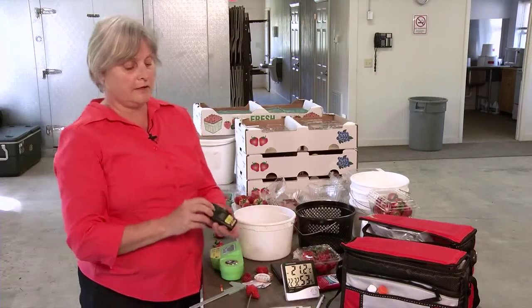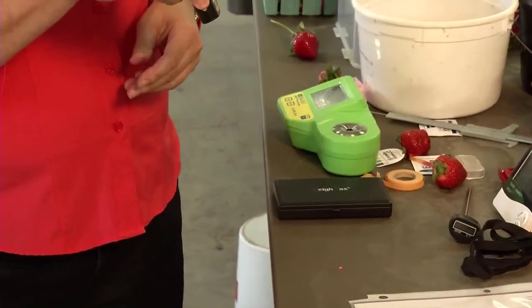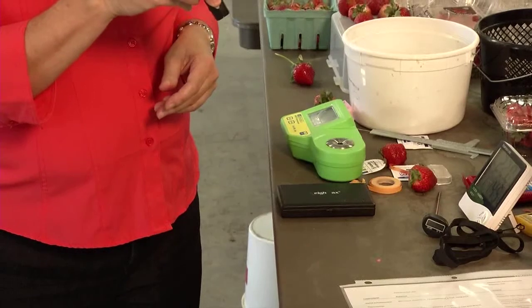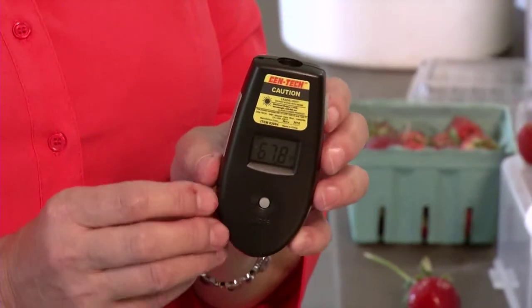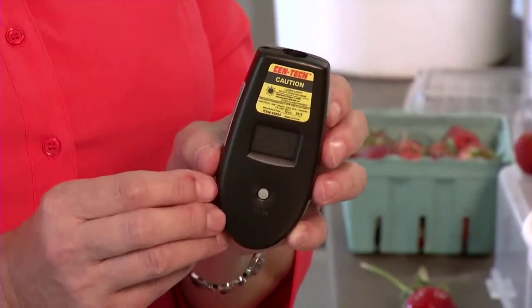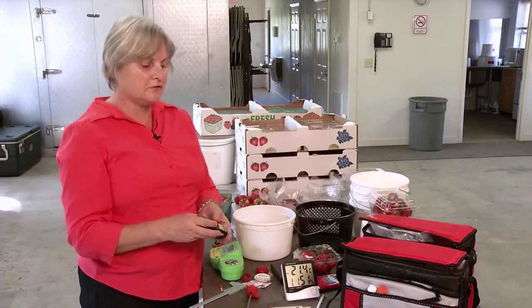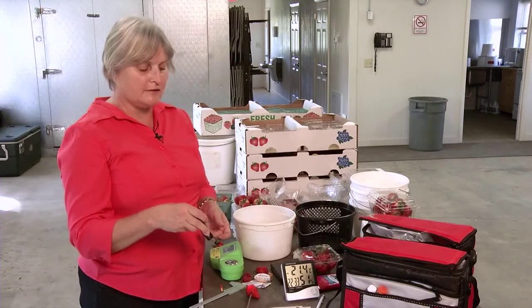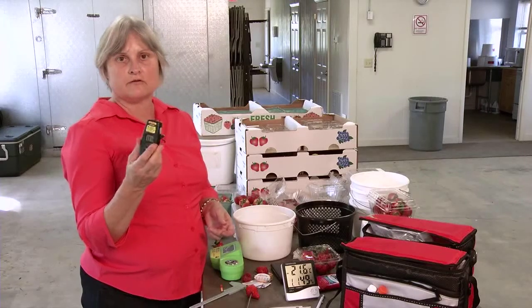These right here I like — they're laser guided. What they do is give you a readout so you can stand at the doorway and take a reading of your fruit in the middle of your pallet and get an idea of how cold your fruit are getting. The more expensive models will go as far as 12 to 14 feet with an accurate reading; this one will only go to about six feet. It gives you a nice way that you don't have to walk into your cooler. This particular one is about $20, ranging from $20 to $60 depending on what you get.